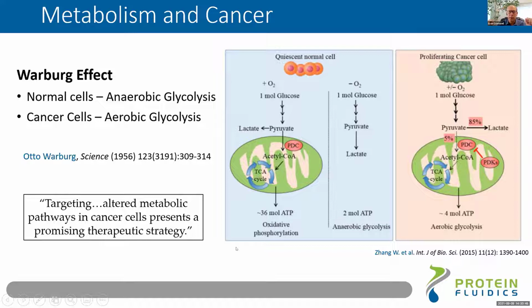But really, the importance from oncology, I think, is looking at metabolism as a target. Can you alter metabolic pathways as a therapeutic strategy in attacking cancer? And if you really want to understand how that works, I think it's important to do dynamics, that you can't just look at the endpoint of it, because the cells are going to be dead and they're not going to be metabolizing. But if you can look at those intermediate steps, and we'll show some data, you can really look at disease modeling. How do cells respond to cancer treatments? How does metabolism respond? I think it's a very exciting field.